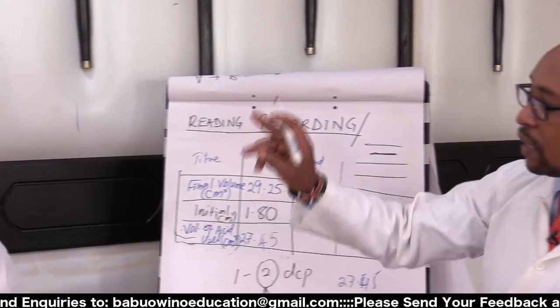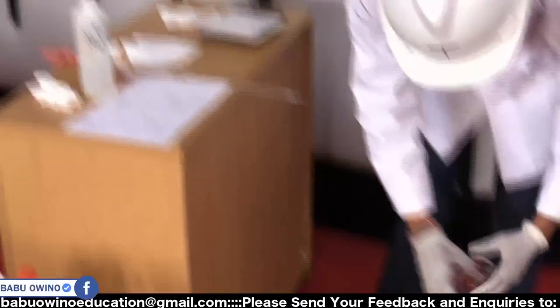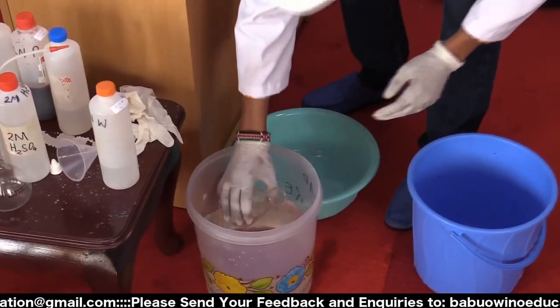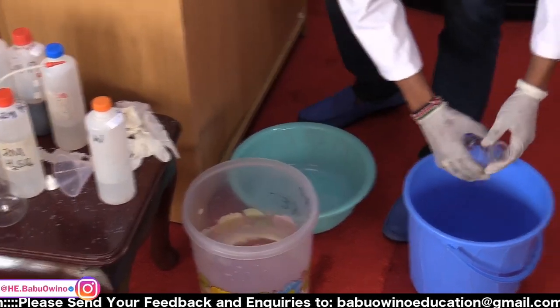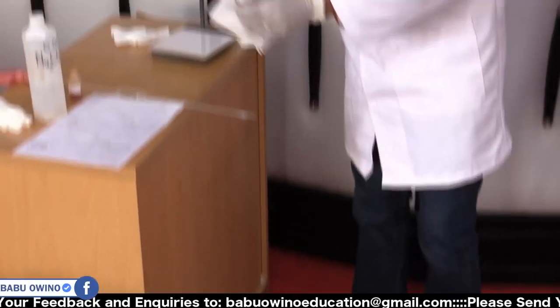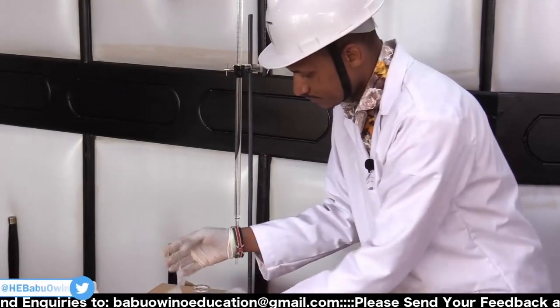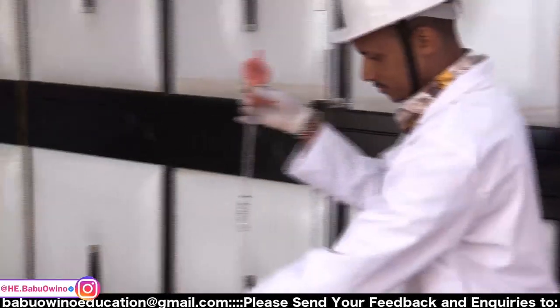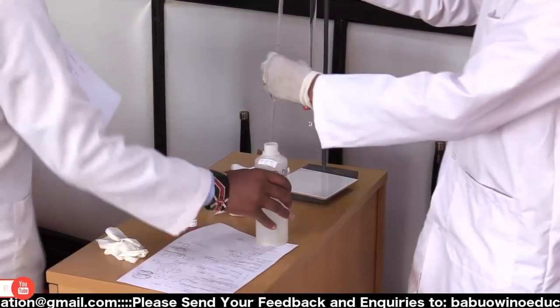So we again allow what Mheshimiwa is doing there. Do away with the first solution, and then you rinse. It's okay. Rinse your conical flask. Then again, use your pipette. Get another solution of sodium carbonate.